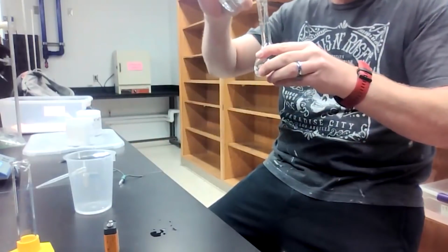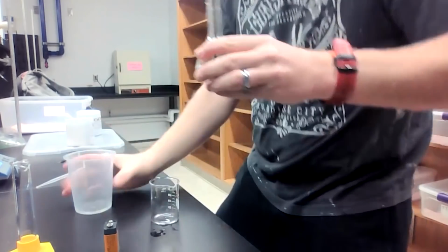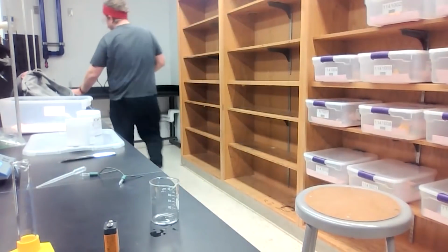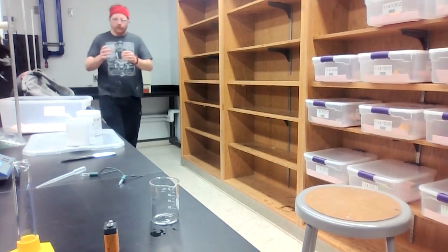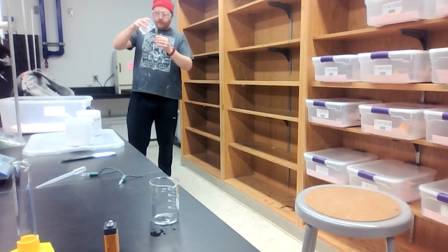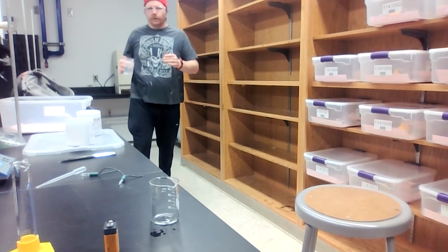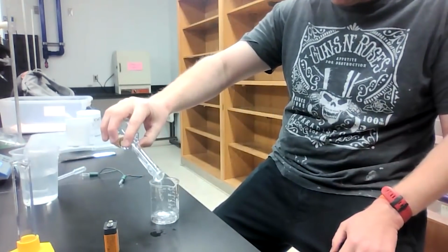I need to get 100 milliliters of this dilute solution. I made a mistake there. I need to adjust this up to 100 milliliters. Okay, I got my last dilute solution of sodium chloride.